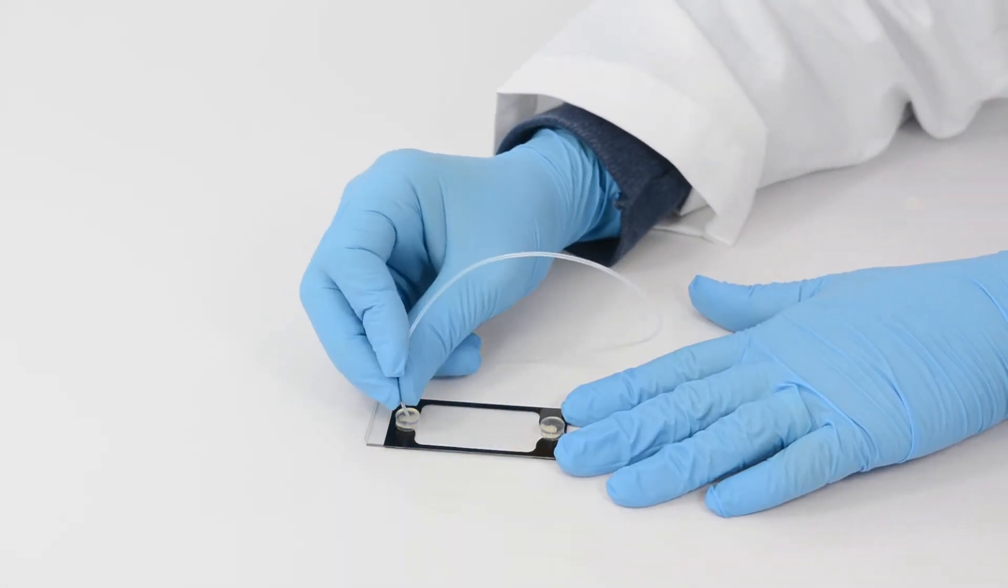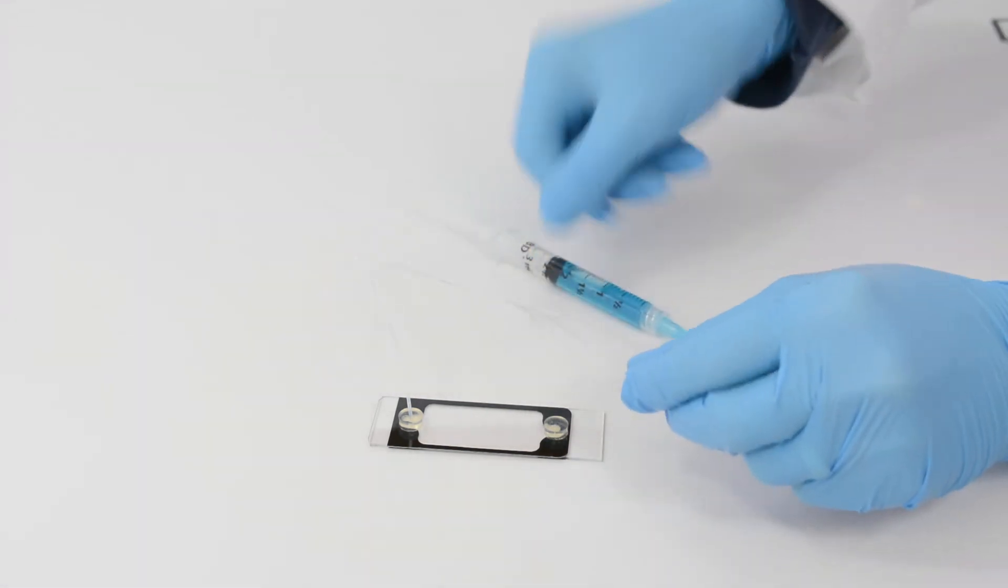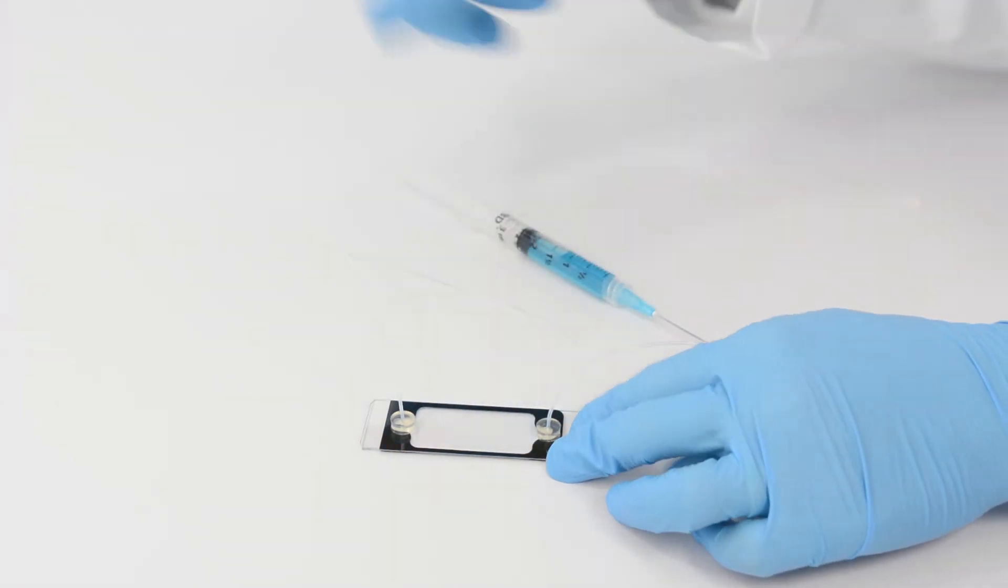Standard tubing may be inserted into the tubing connectors. A syringe or syringe pump may be used to load reagents into the chamber.